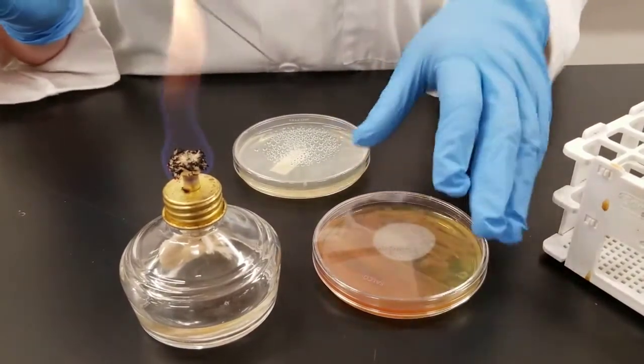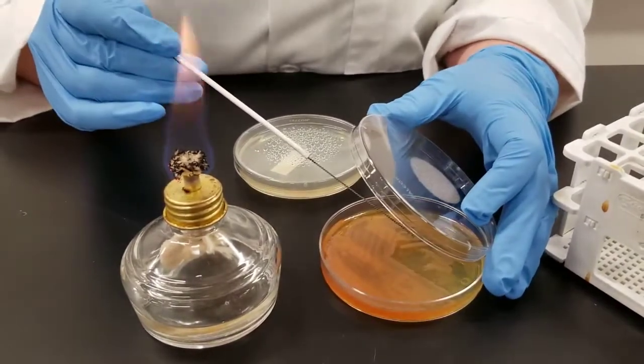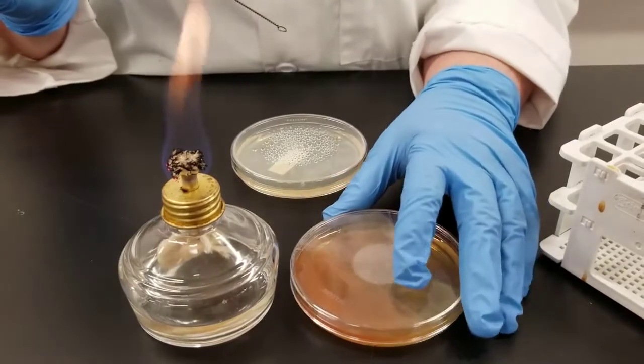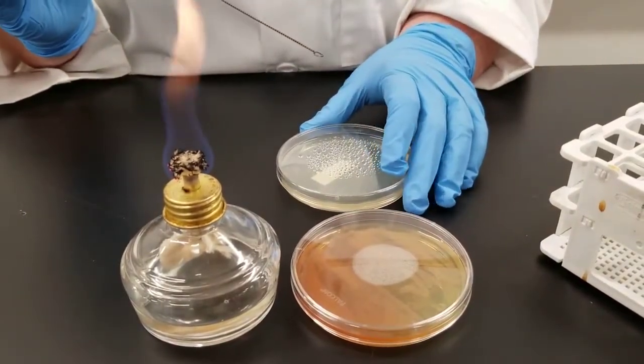Once again I have flamed the loop, so now I need to go into my stock plate and pick a sample. Now, what I'm going to do on this TSA plate — tryptic soy agar plate — it's like nutrient agar. Most everything will grow on it.